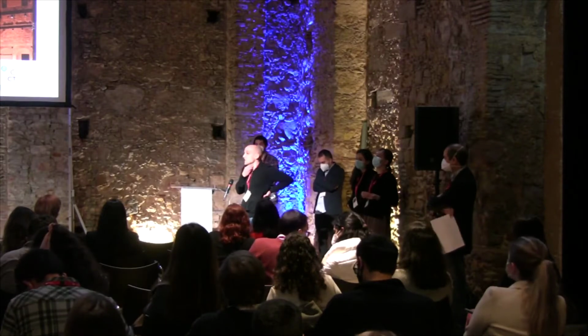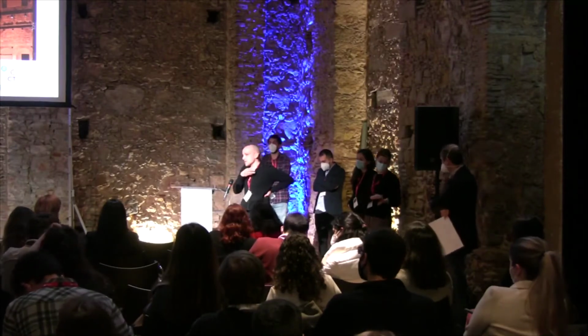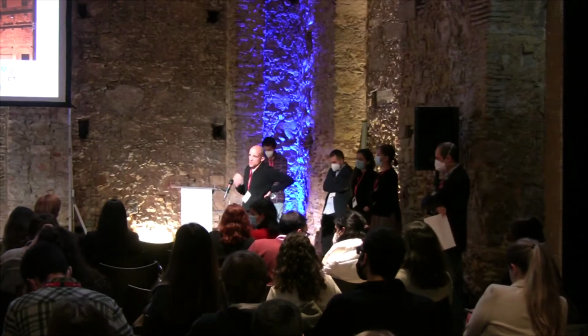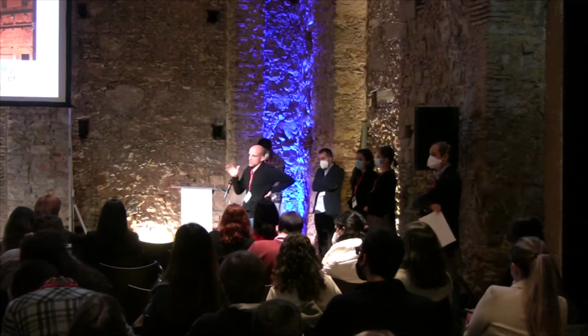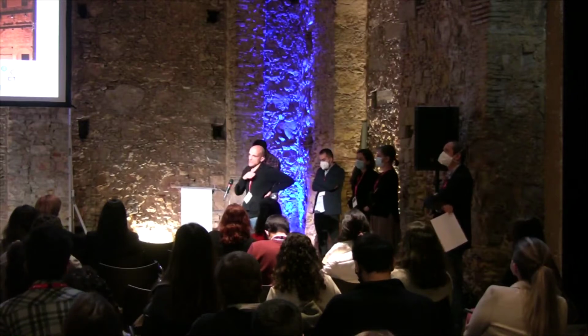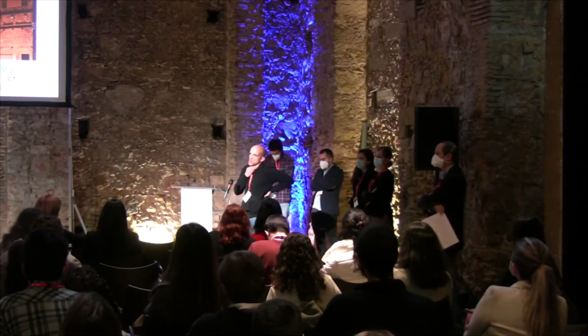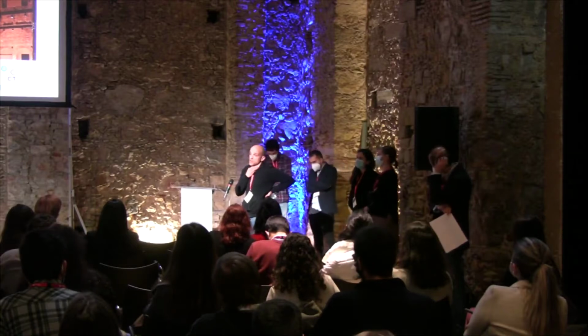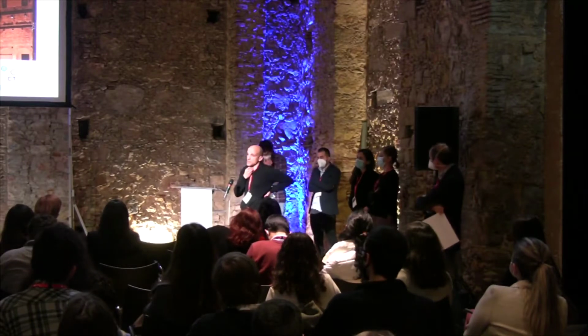So I didn't try the non-hydrolyzable nucleotides. I decided to go for what's being used in structural biology of these families, just making this double mutant that eliminates the ATP hydrolysis. Yeah, definitely you could try other types of nucleotides.